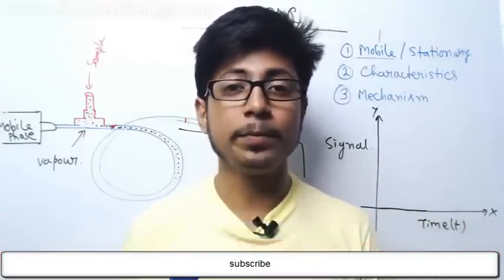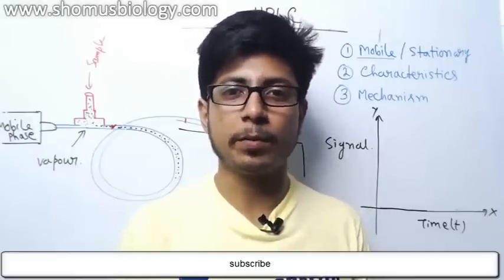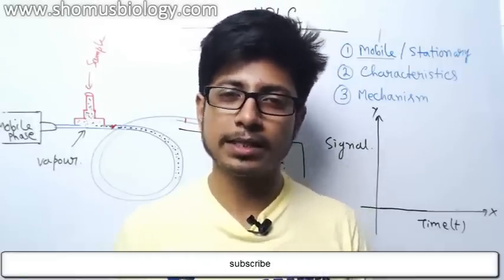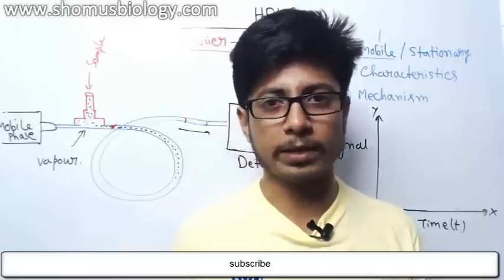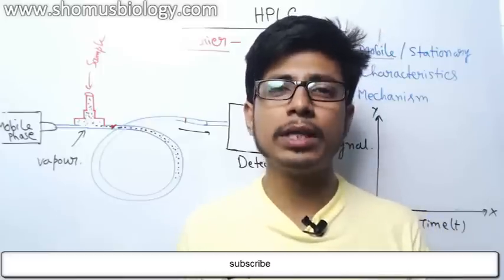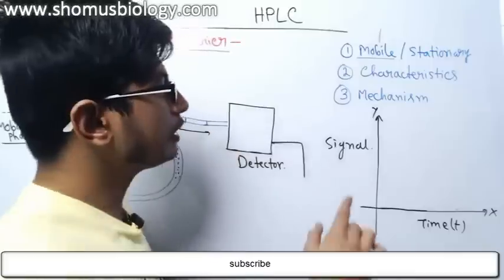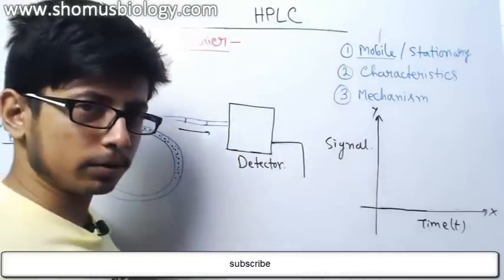In this video lecture, we'll be talking about HPLC, or high performance liquid chromatography. It's a variant of liquid chromatography. We've talked about gas chromatography, and I told you that when you are reading any kind of chromatography lectures and videos, you need to understand three important mechanisms.